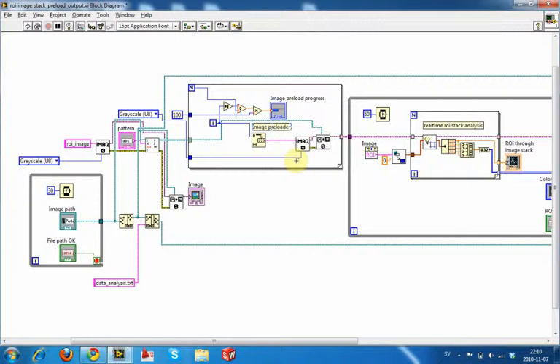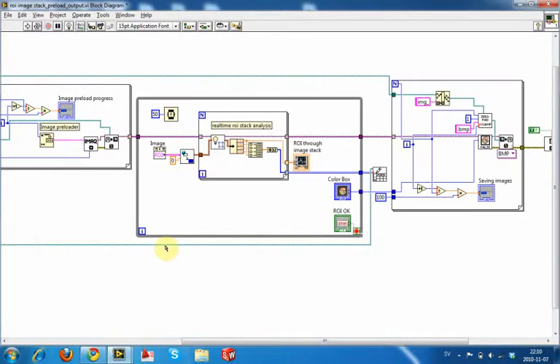We load the images, and then we go over here, and we're going to look at each of the ROIs using that pre-built light bulb application. I'll show you the little sub-VI that is quite handy to have, which just converts a global rectangle to a rectangle, so we don't need to mess around with this data set. We can just use this to switch the 2 rectangle types over.